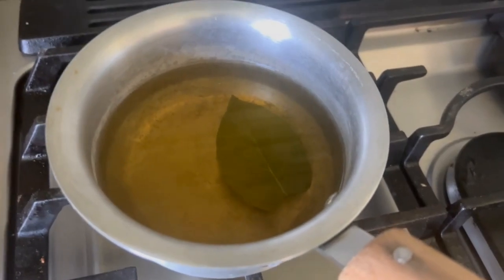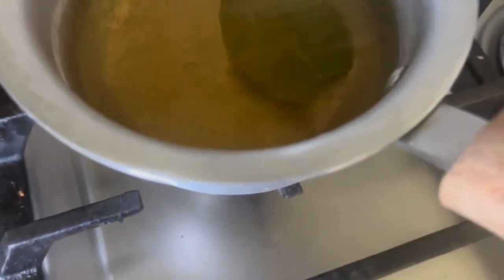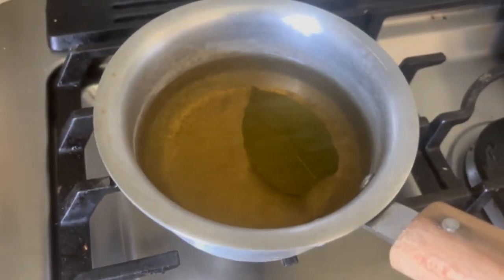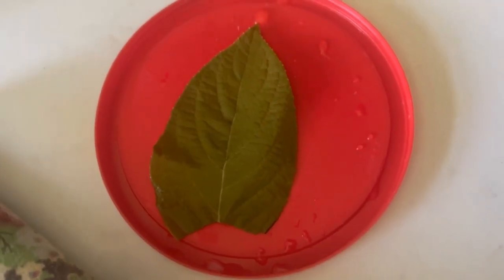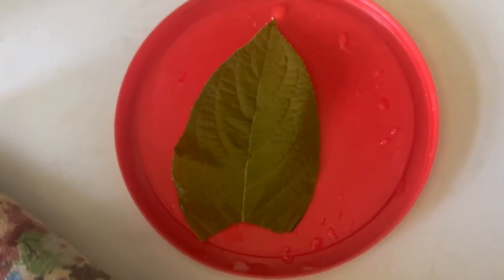We're back — we've finished boiling, and now we have something that looks like green tea. That actually smells really nice. Another reason to do it at home is you can smell it yourself! Now that we've finished boiling, I'll extract the leaf. The leaf has been successfully extracted, and of course for those following along at home, wash out your pot.